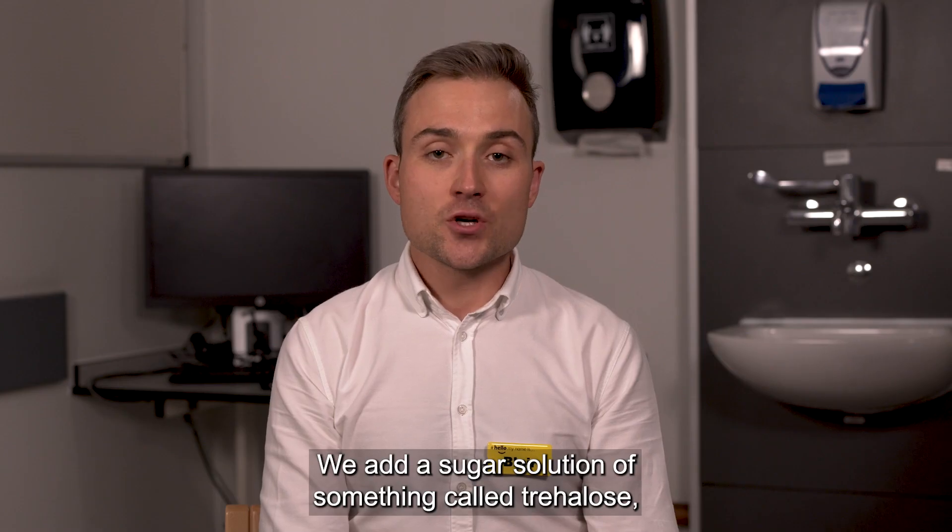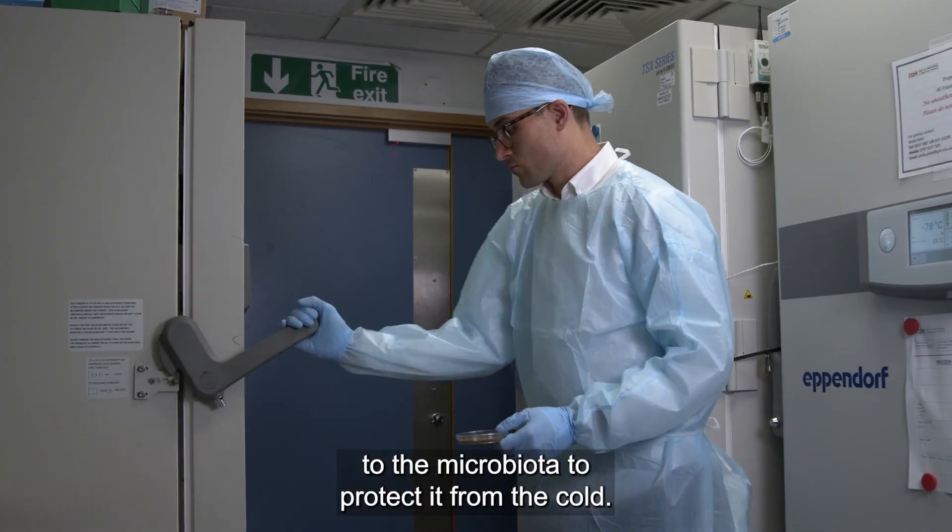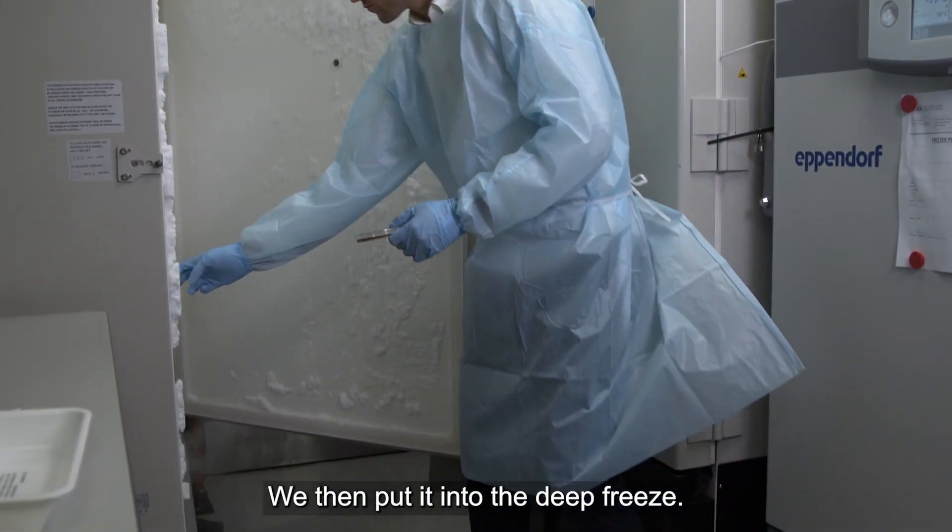We add a sugar solution of something called trehalose to the microbiota to protect it from the cold. We then put it into the deep freeze.